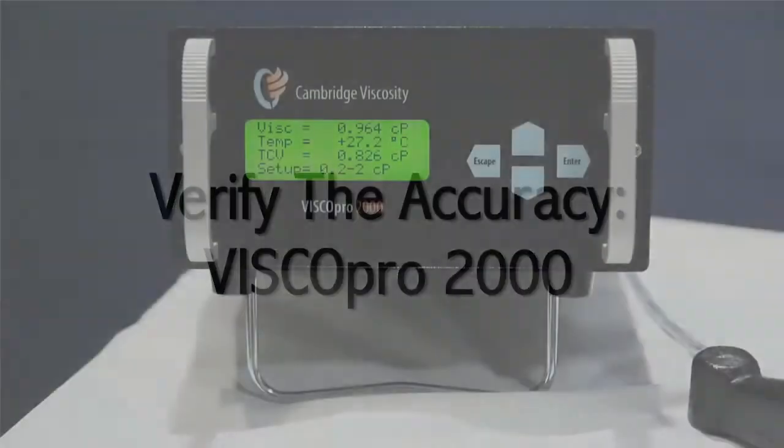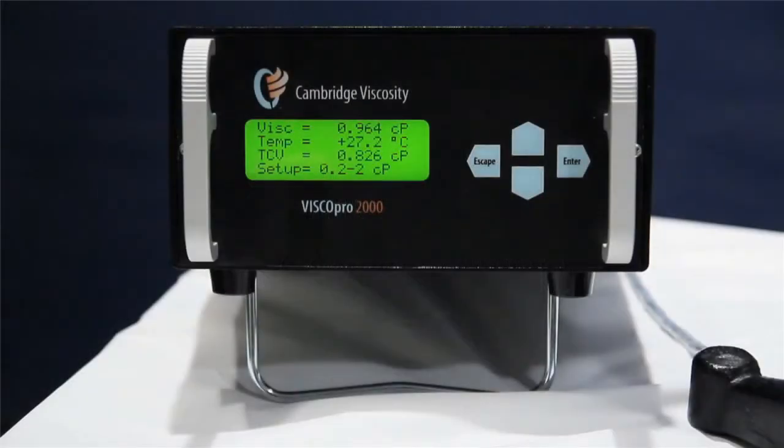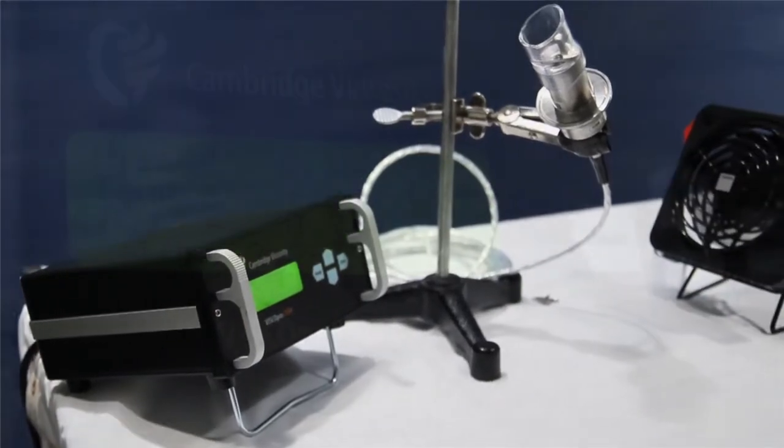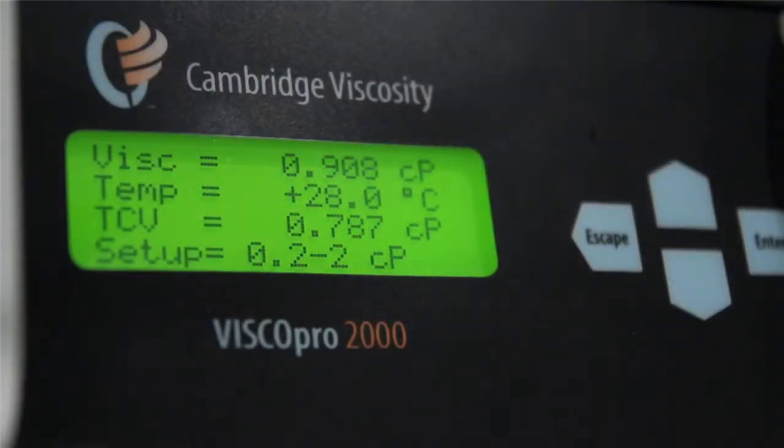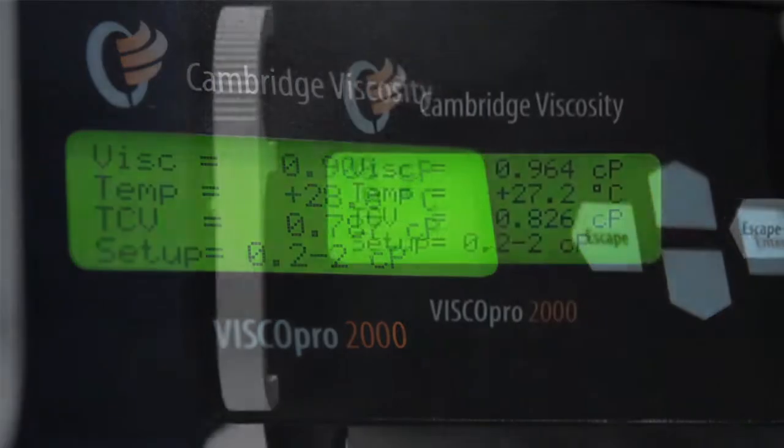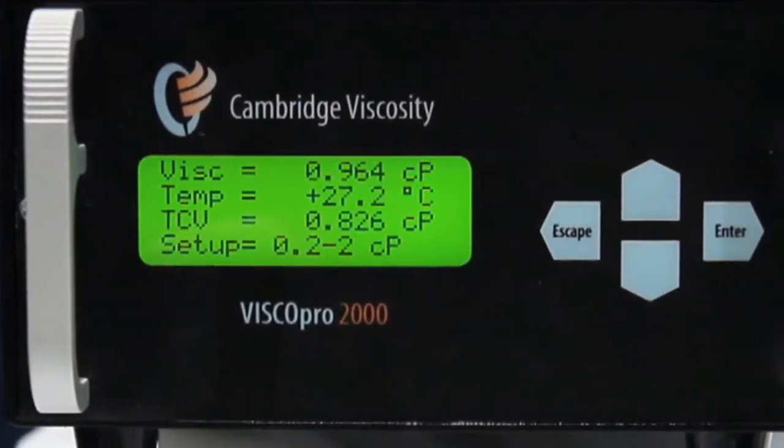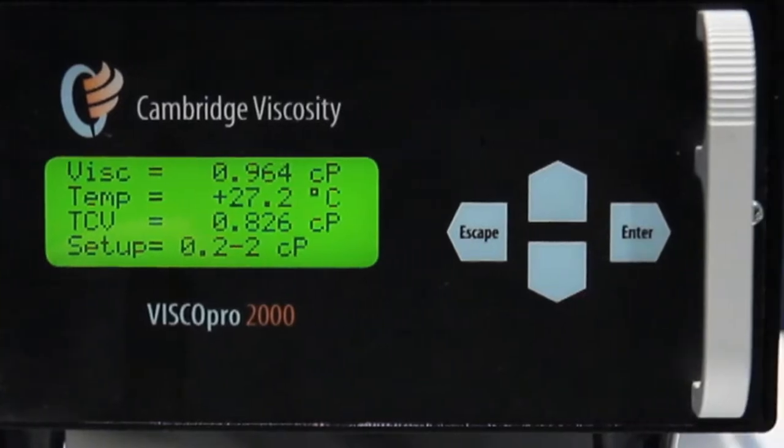We are now going to show you how to verify the accuracy of your VSCO Pro 2000. The same technique can be used to verify the accuracy of the VSCO Pro 1600. However, if the 1600 does not have the optional display, viscosity and temperature information can be obtained through the 4-20 mA signals or through the RS-485 serial connection.